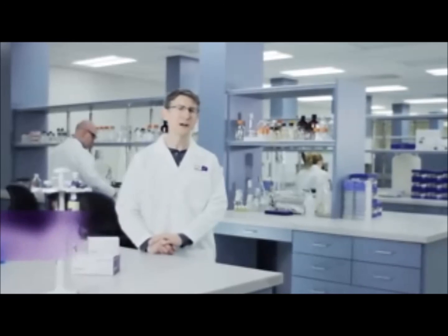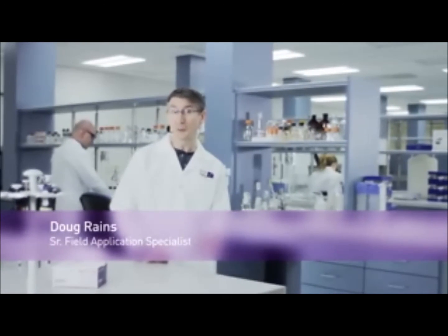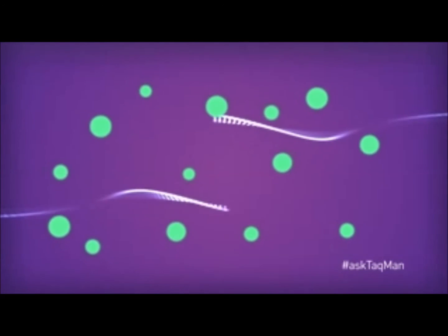Are you using SYBR Green chemistry for your real-time experiments and getting multiple peaks in your melt curve? And are you asking yourself, is this a bad thing? Let's start with a little background. SYBR Green chemistry is a free-floating dye. When SYBR Green dye is just swimming around in the tube, it doesn't give off much fluorescence, even when we zap it with a light source on a real-time instrument.